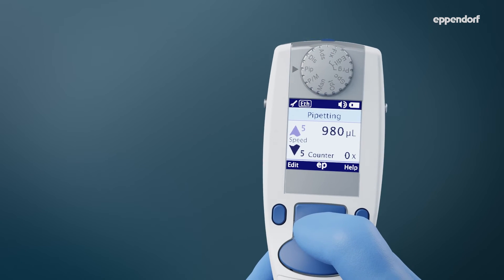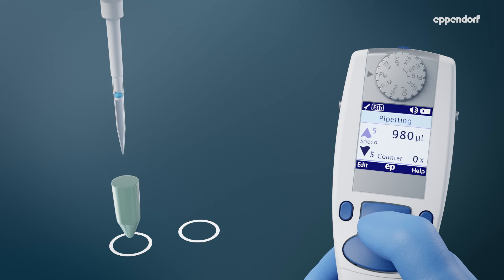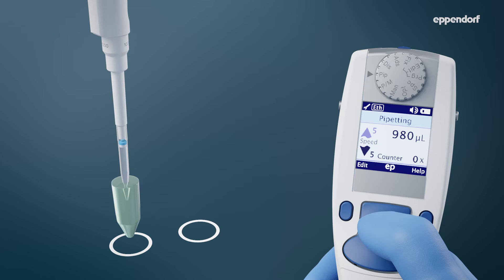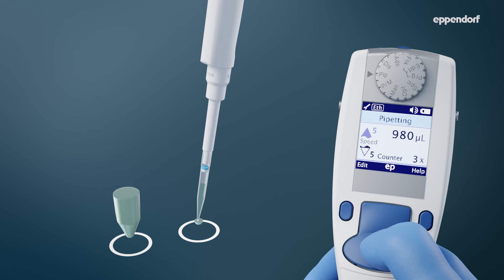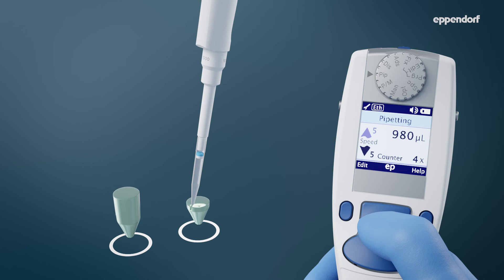With an adjustment set to ethanol or glycerol, use the following technique for optimal results: use a speed of 5 and pre-wet at least 3 times. Wait at least 2 seconds after dispensing before triggering a blowout.